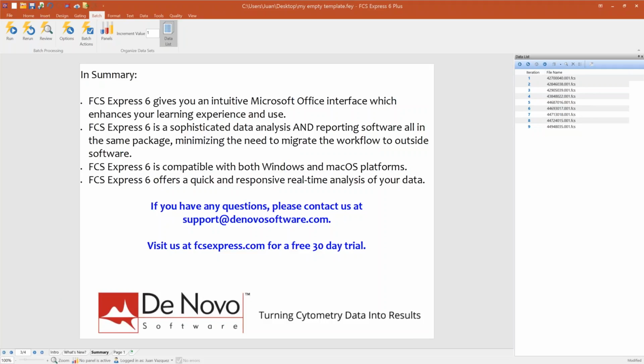Yeah, so we did have a specific webinar regarding transformations earlier this fall. So there is a webinar currently on our website where you can view that webinar and you can go over it in detail. I was the one that hosted it, and we also had our developer, who helped implement a lot of those transformations into the software, as a panelist within that webinar. So please feel free to go to our website, denovosoftware.com, and you can find that webinar from our recorded webinars page.